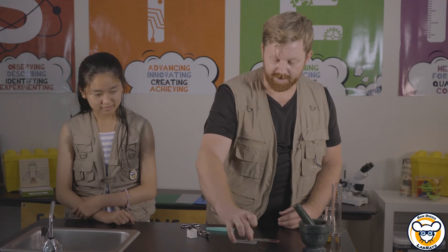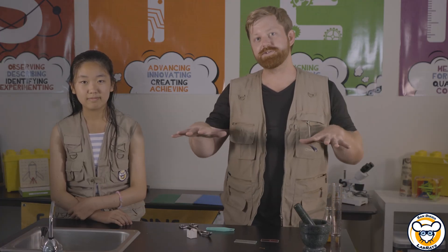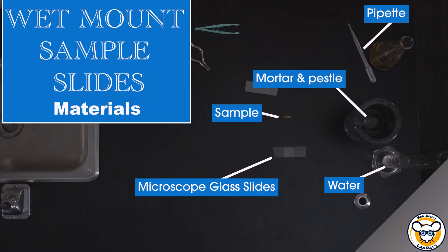Now, if you're dealing with something that maybe is a little bit smaller in nature, something that you want to make sure is spread out so you can look at the deeper structure, then you're going to want to do a wet mount slide.